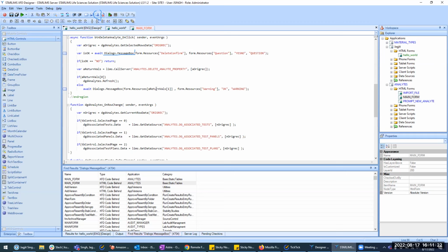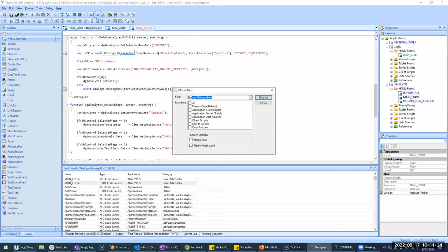Okay, give me a sec. Yeah, right there. It's like that. And then he hit forms. Forms. Yep. You got it then? Good. Yeah, let me try again. Click forms.